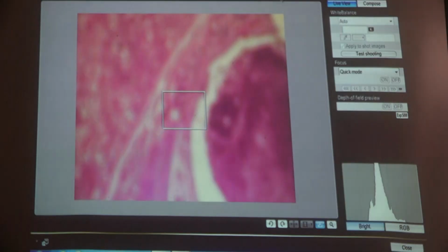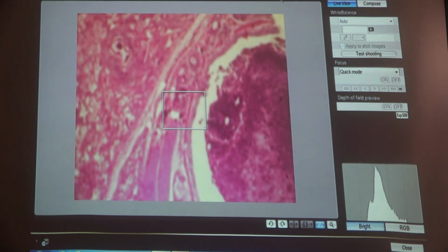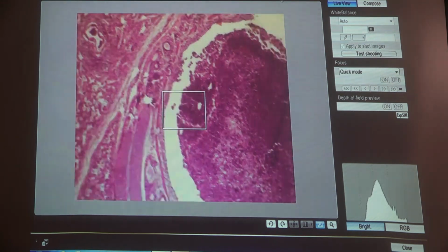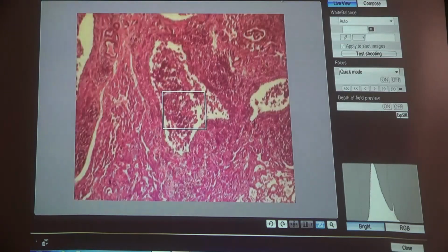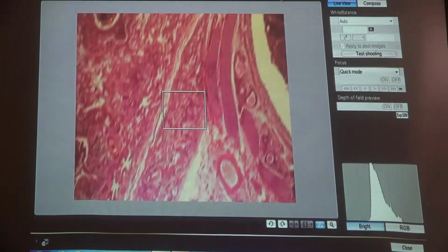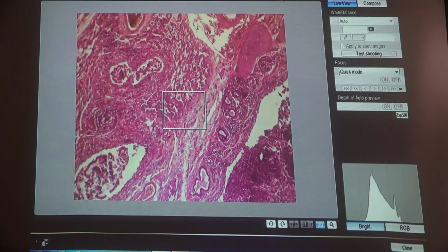This slide represents acute inflammatory process of the lung tissue. It is called bronchopneumonia, in which there is heavy acute inflammatory cells infiltration of the lung tissue. Most of the alveoli and interstitial tissue and the bronchioles are filled with acute inflammatory cells, mainly neutrophils.